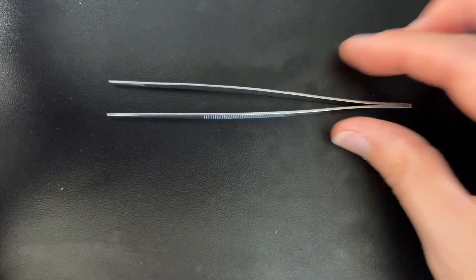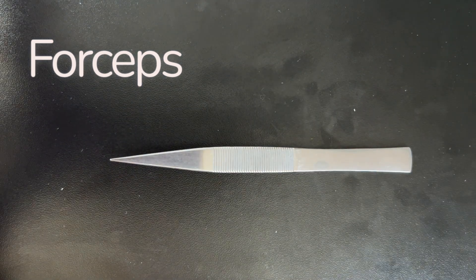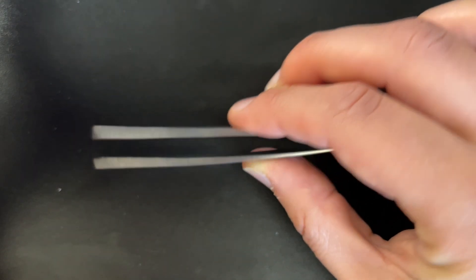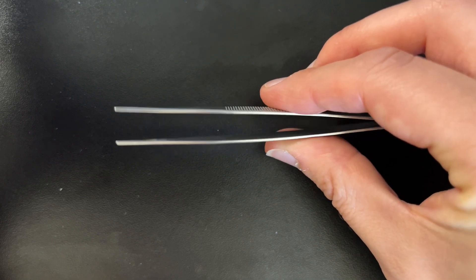Next up, we have our forceps — you might call these tweezers, but in the biology lab we often call them forceps. They're used for lifting or grasping parts of organs or parts of the organism. It's very important to keep these on hand along with your probes for lifting, manipulating, and indicating different parts of the organism.